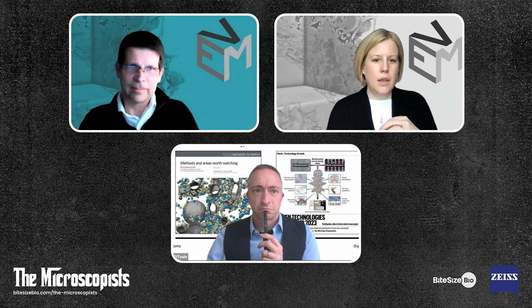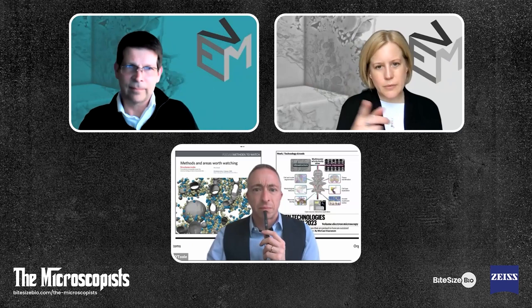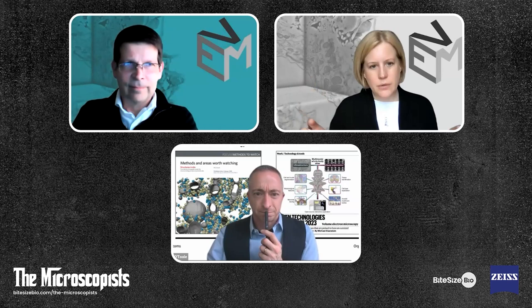Like epilepsy or in brain tumors. And when you add those layers of information, then you start to really get to the differences in health and disease. But we can't at the moment image across all of the scales from atoms or even macromolecules, whole proteins, through to organisms on a single sample.